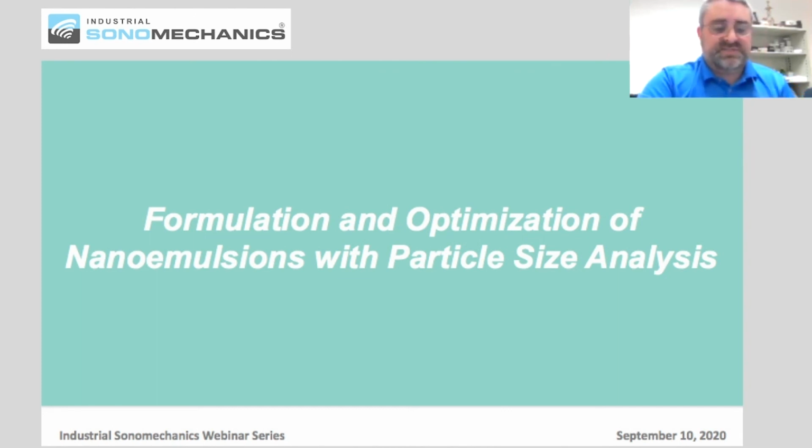So, like I said earlier, laser diffraction is good for unknown samples. It gives you an idea of where it's at and shows trends. Dynamic light scattering is more for fine tuning, because again, we're starting out with something that's going to be pretty large and then working our way down to getting it to a nanoemulsion. So using the combination of the two is good. If you have one or the other, you just have to be aware of the limitations of the technique and of what it's actually measuring.